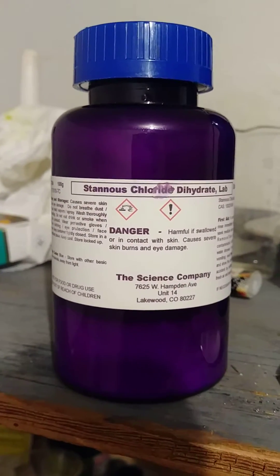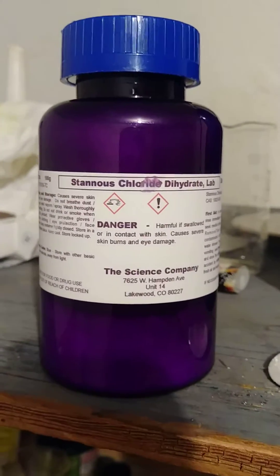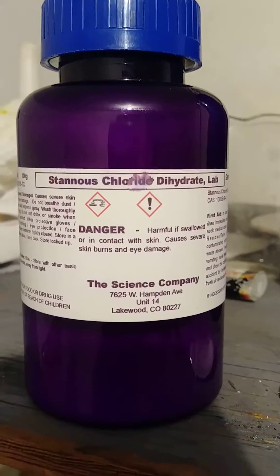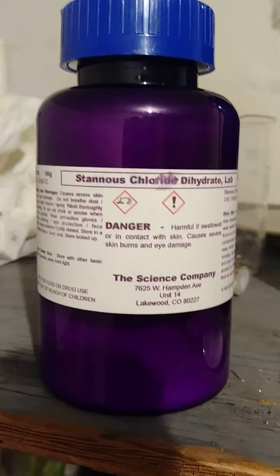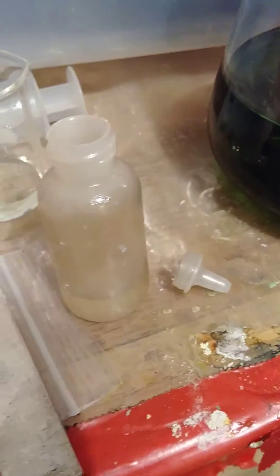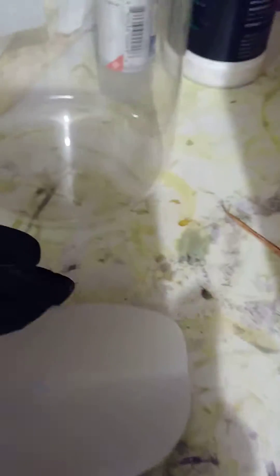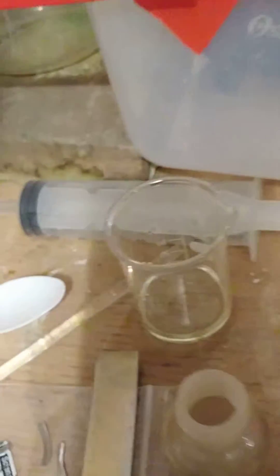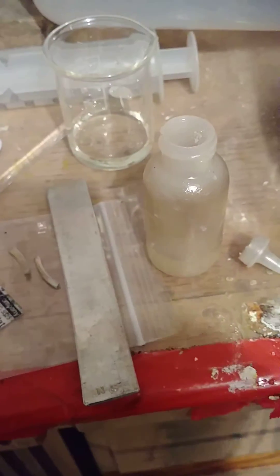When making stannous chloride for testing solutions, I prefer to use stannous chloride dihydrate — it comes in crystal form. I'm about to show you how I make mine. My stannous is running really low; I've got about 2 grams here of the crystals. I add it to my bottle of stannous.